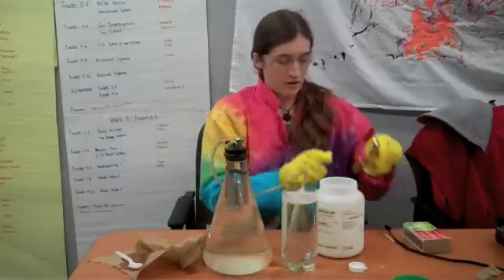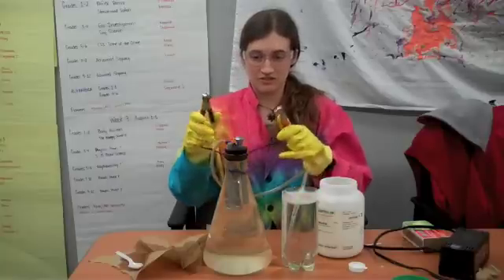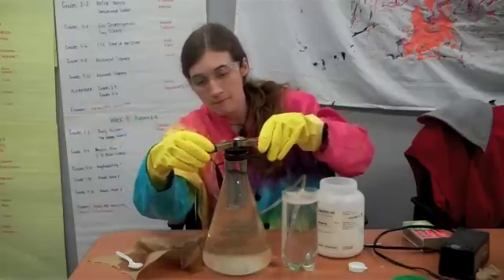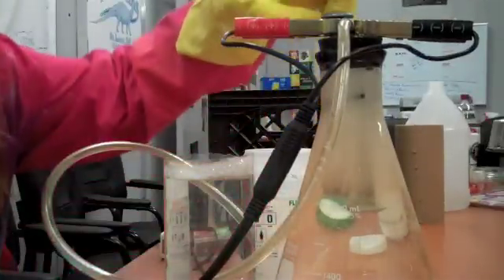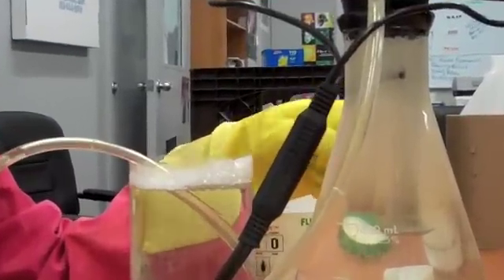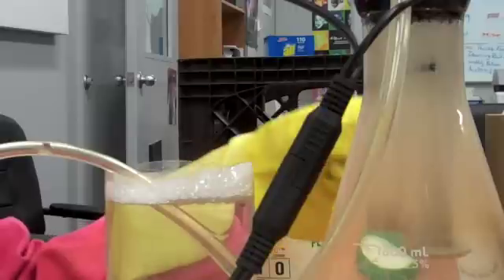I'm going to plug this into a battery charger here so that we can get some electricity flowing. Now that the electrodes are plugged in, they're essentially electrocuting the water in here — sending electricity through and ripping the water apart. Water is, of course, H2O, and so it's ripping it into two hydrogens and one oxygen.